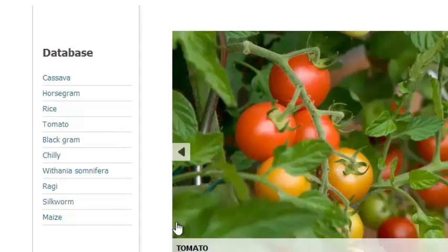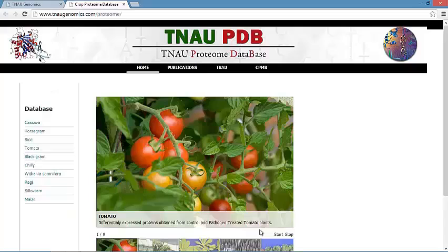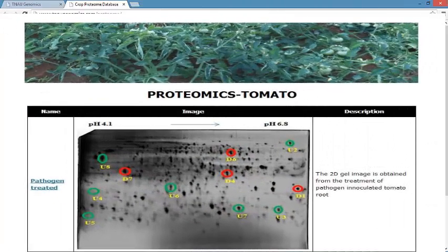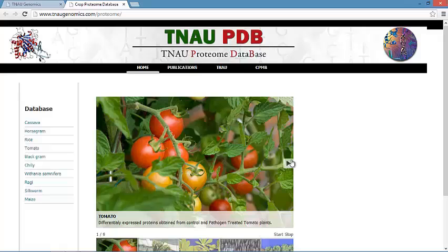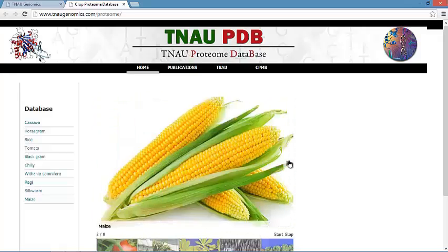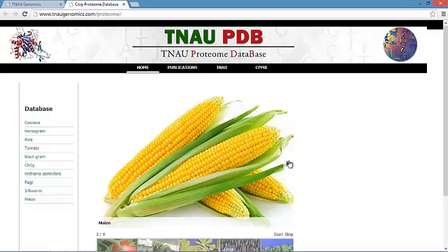In the tomato database, differentially expressed proteins are obtained from control and pathogen-treated tomato plants, which shows upregulated and downregulated proteins. In the maize database, protein profiling is done between two contrasting maize varieties differing in salinity tolerance. The gel contains maize downregulated and upregulated protein spots.